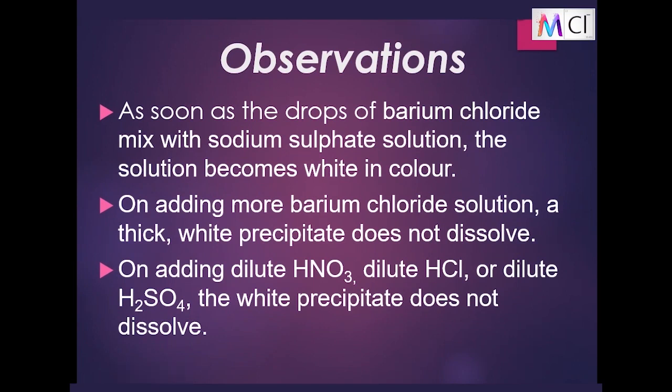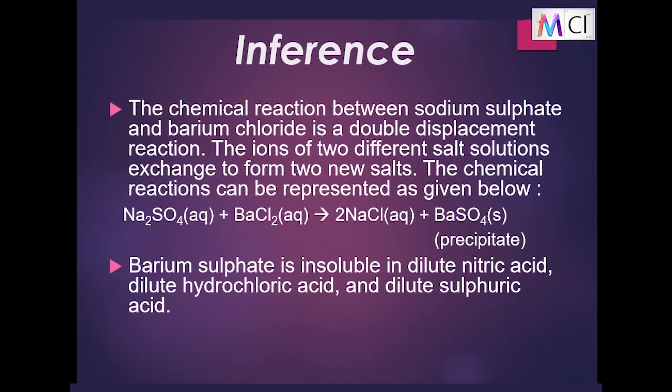Observations. As soon as the drops of barium chloride mix with the sodium sulfate solution, the solution becomes white in color. On adding more barium chloride solution, a thick white precipitate forms which does not dissolve. On adding dilute nitric acid or dilute hydrochloric acid or dilute sulfuric acid, the white precipitate does not dissolve. Inference.